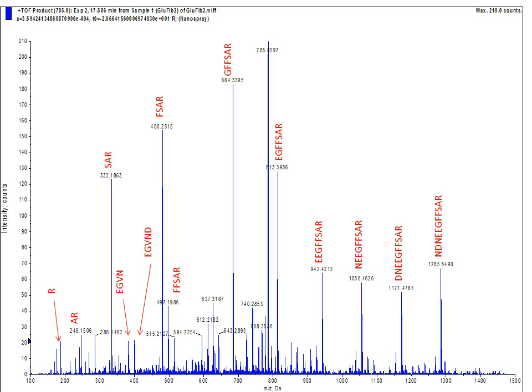The molecules of the C12 isotope of glu-fib are then selected by Q1 and transmitted to the collision cell, where collisions with nitrogen gas molecules cause fragmentation. Thousands of molecules of the same peptide are present, and different molecules fragment through different bonds, thus producing different mass fragments. When these are measured, this is the resulting spectra.